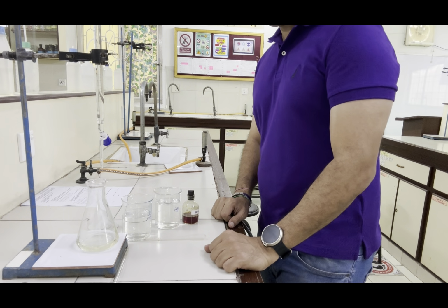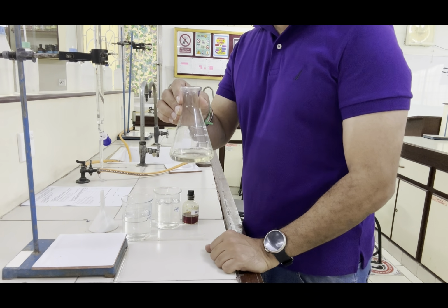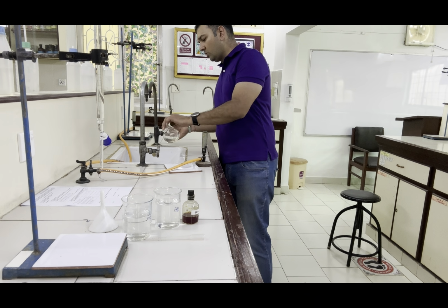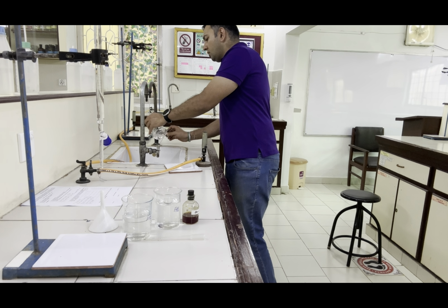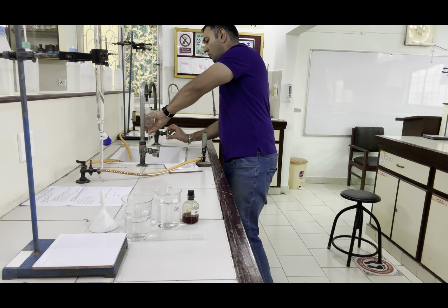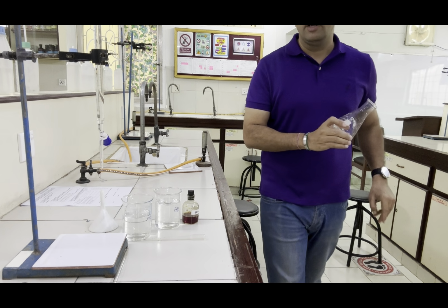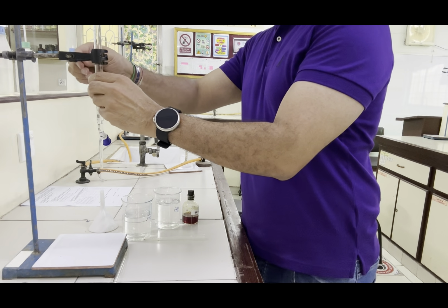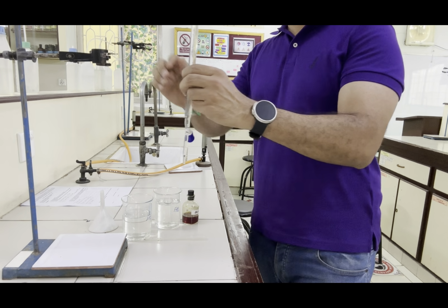Before I start the accurate titration, I need to empty this flask first, and I will rinse it with distilled water or tap water. Now I have to refill the burette again because it's used up till 28.80 volume.